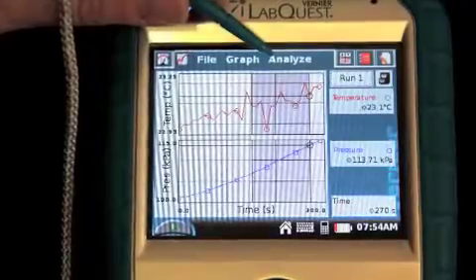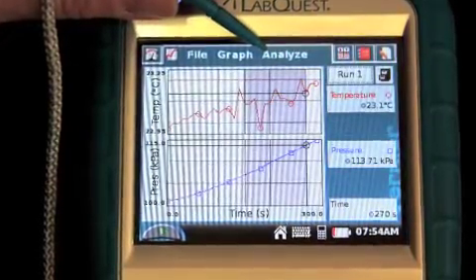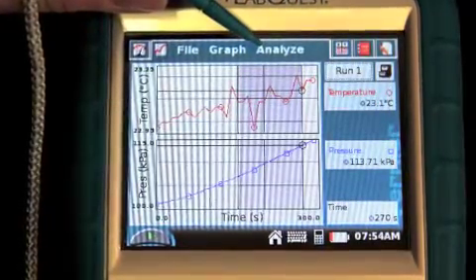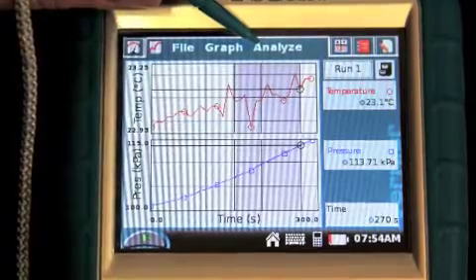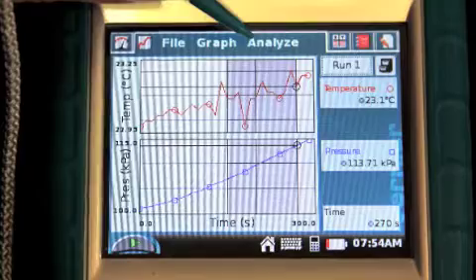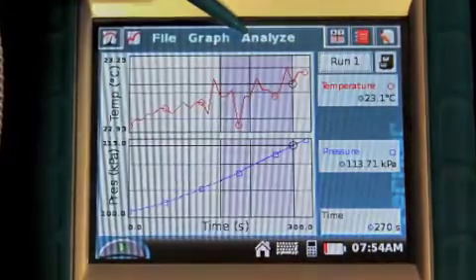Now that we have our section of graph selected, what we want to do is to determine the slope of just this portion of the graph, because remember, what we're looking at in this lab is the rate that the oxygen was being produced, and the way we're going to analyze that is by the rate that the pressure was increasing.